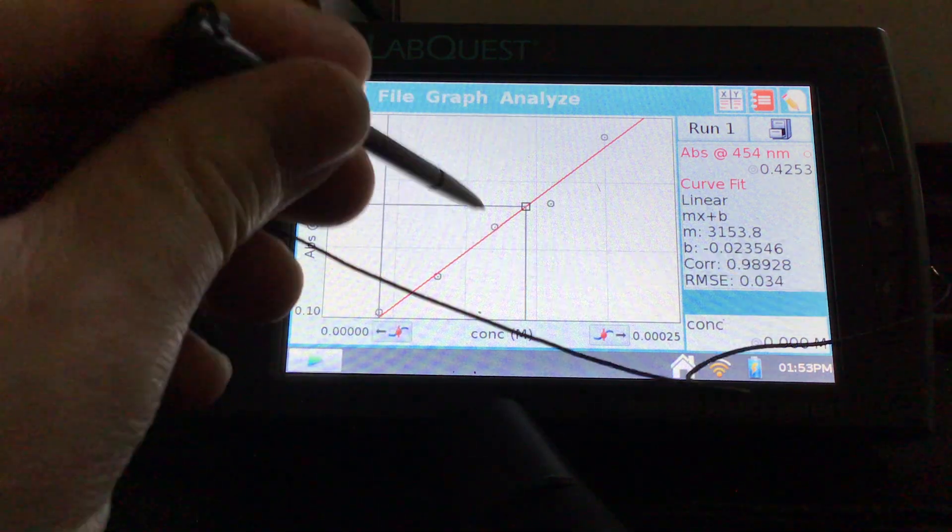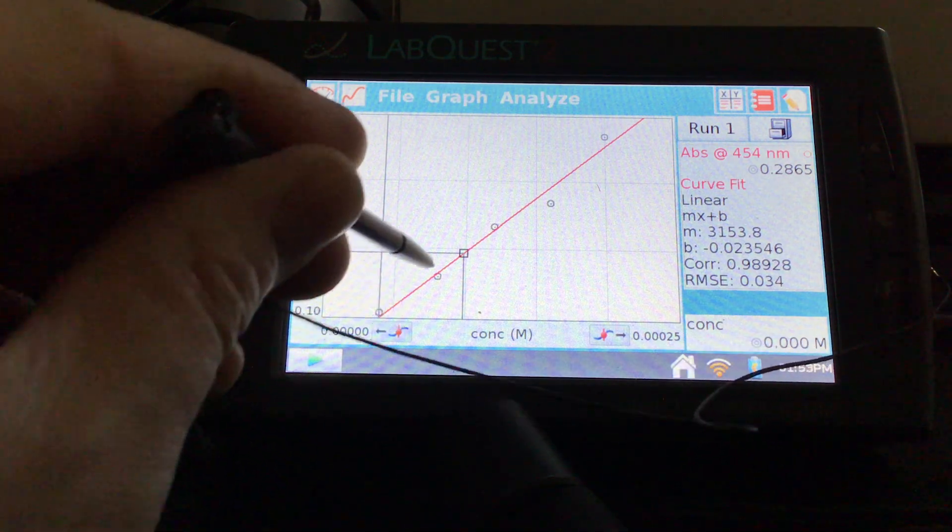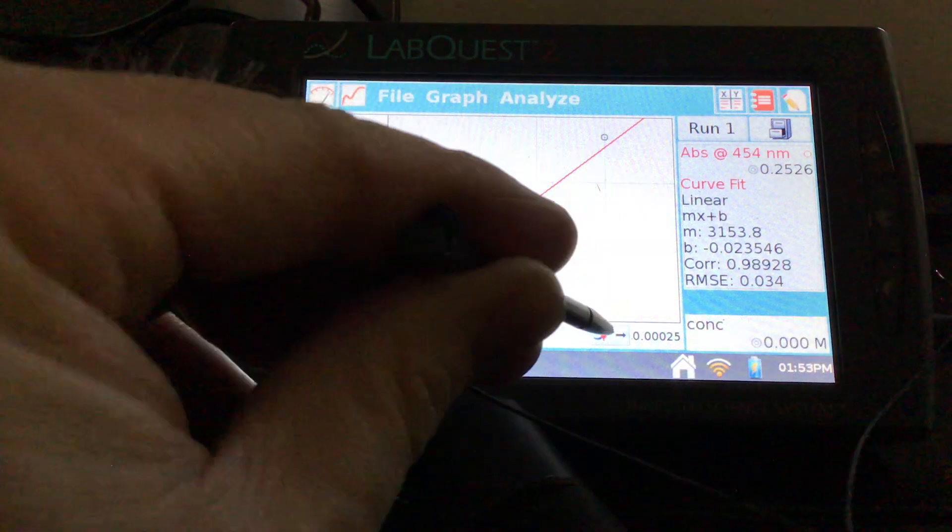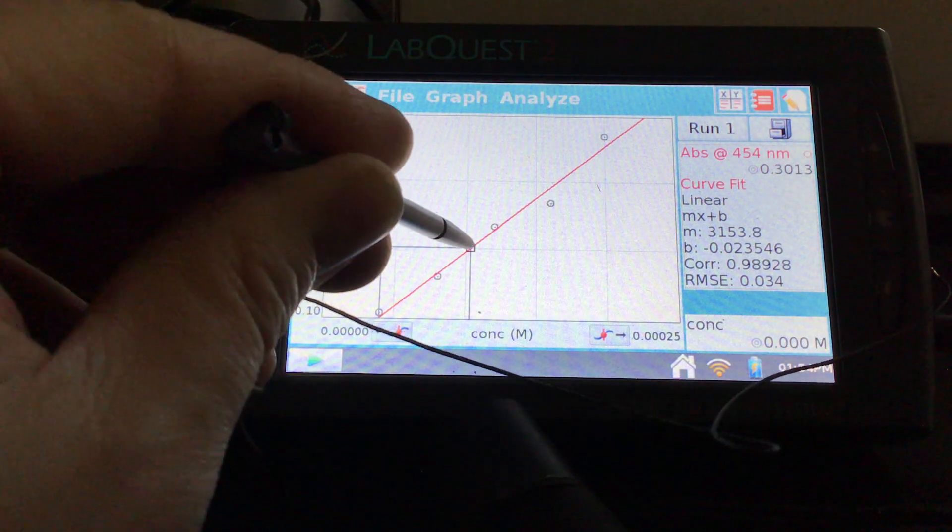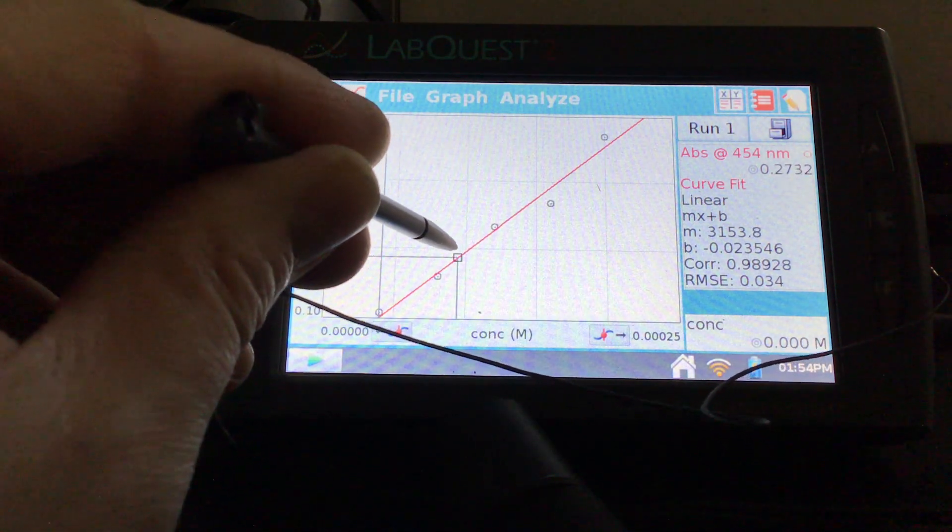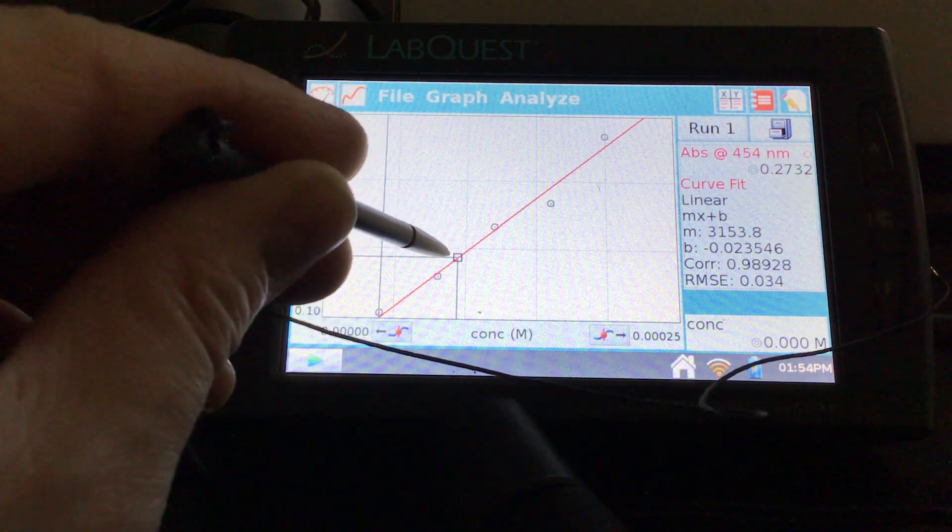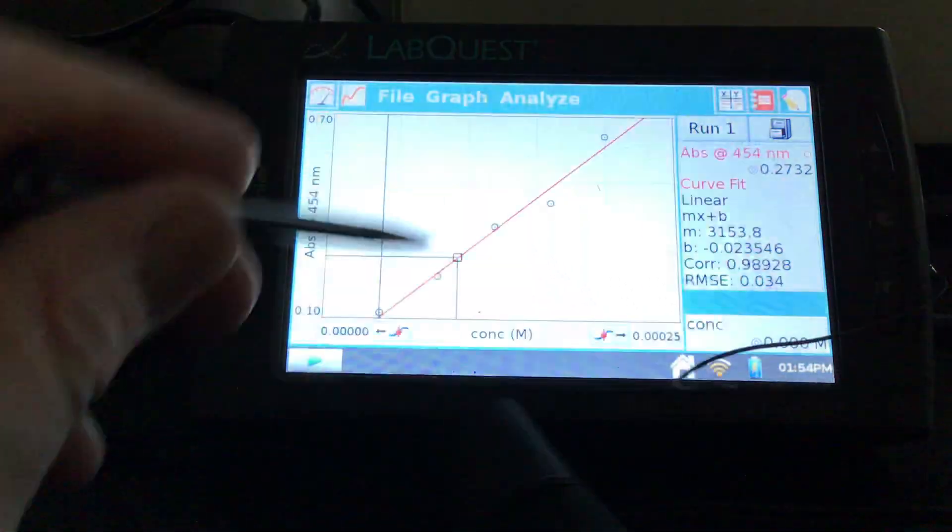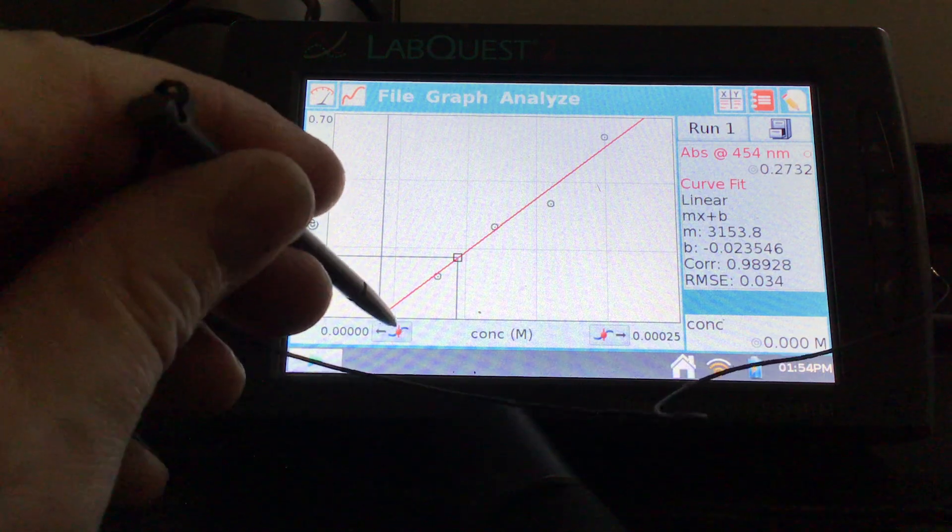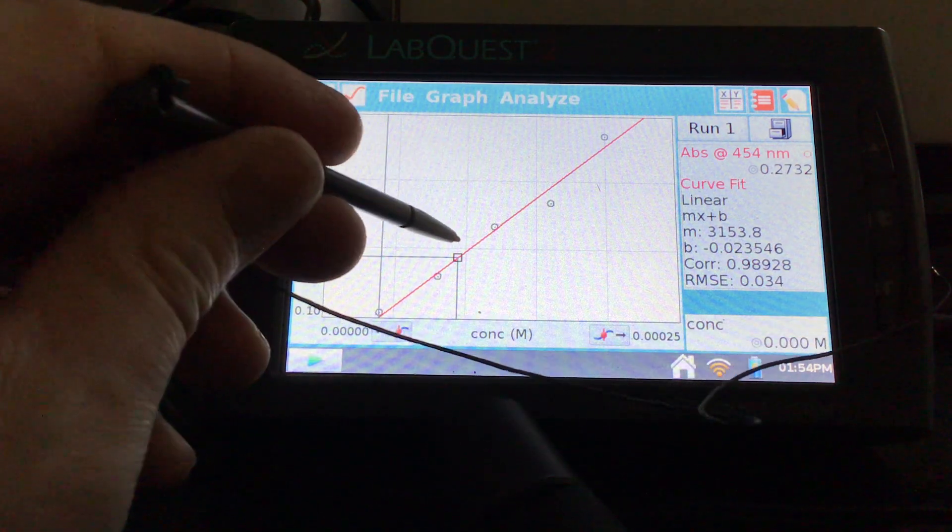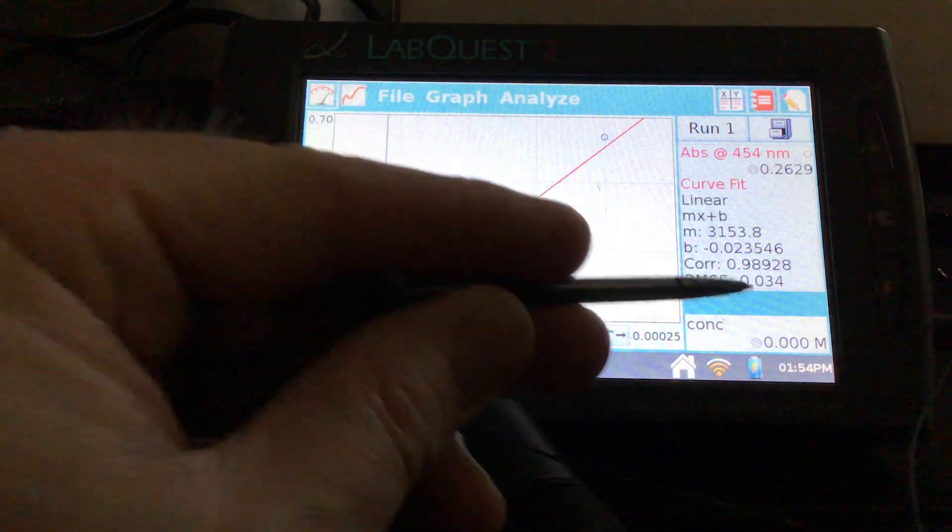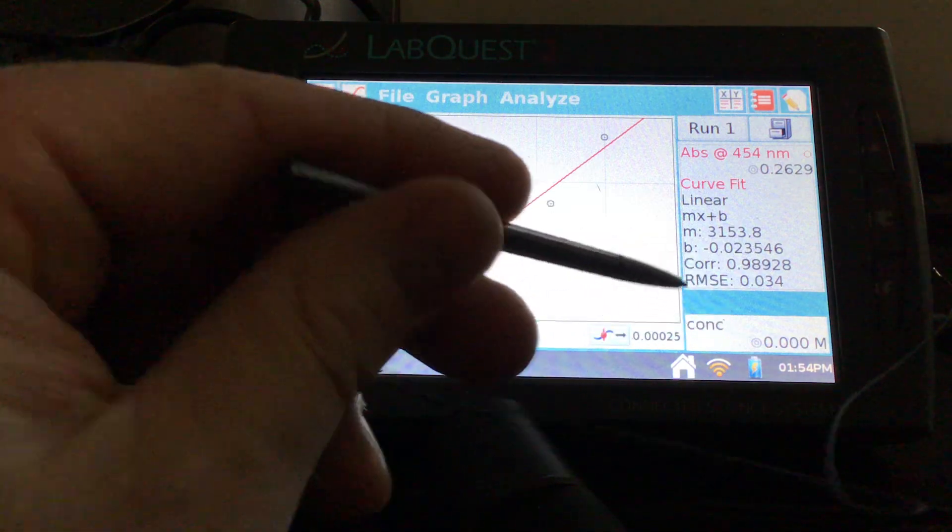For some reason, it's not playing nice today. Let's see. Hmm. Technical issues here this morning. So we had about 0.267 or 0.27. So that's pretty close. So for some reason these buttons aren't working, they normally work. I might have hit something that's weird or it's just not working for me. So that's how we would do that. And for some reason it's not showing me my concentration down here, which is kind of weird.